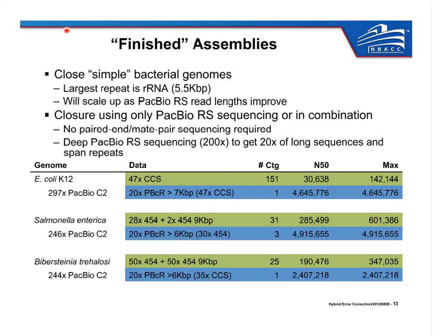As the PacBio read lengths improve, this will automatically scale up. So the recipe doesn't need to change as the technology improves. You can keep using the same recipe, and the genomes that are simple will keep expanding, and the definition of simple will keep increasing and increasing.